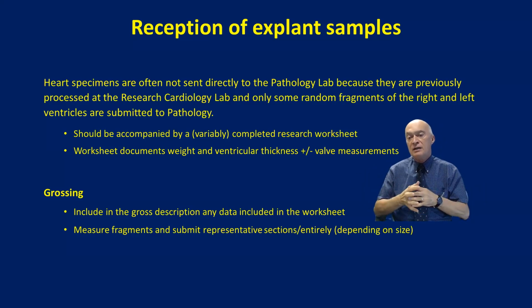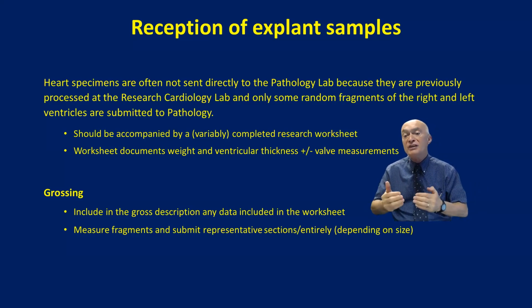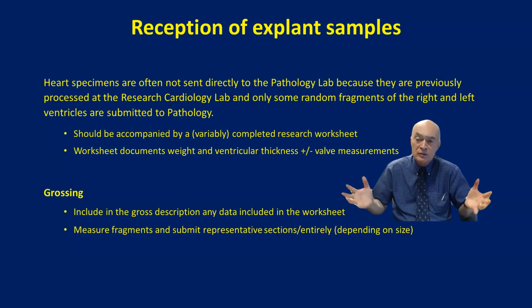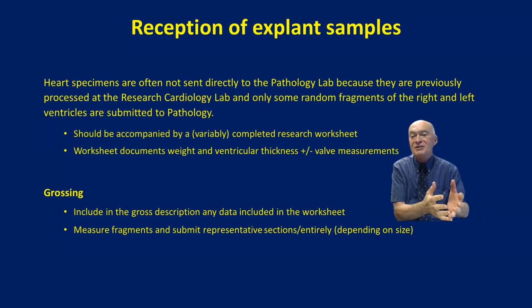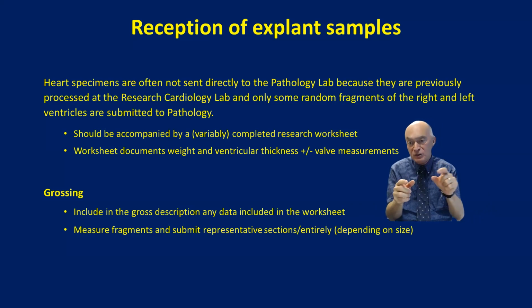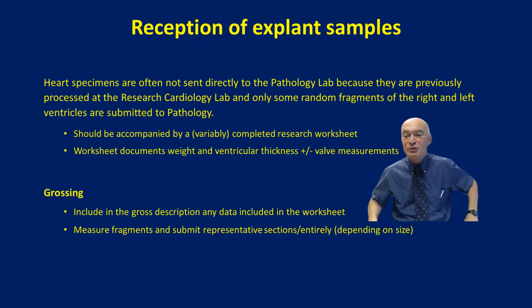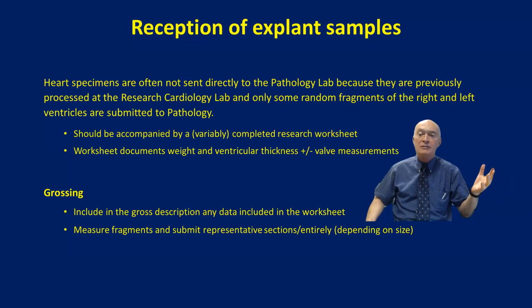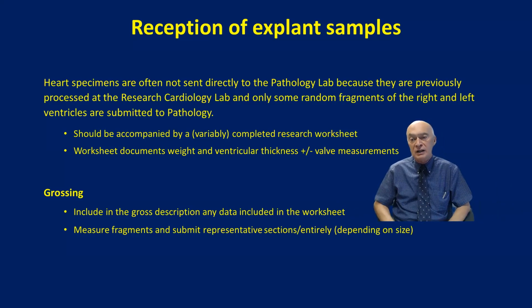the weight, etc. Just recently, we signed out a heart that originally was 500 grams, but the heart that we received was only 350 grams. So they have removed a very significant amount of tissue and we were not able to study that part of the tissue. But in many other cases, you still don't have the whole heart. You just have these pieces that we say in Peru is just a piece for the cats because it's basically not meaningful and it has basically no context. But we can study the coronary arteries or other structures of the heart.